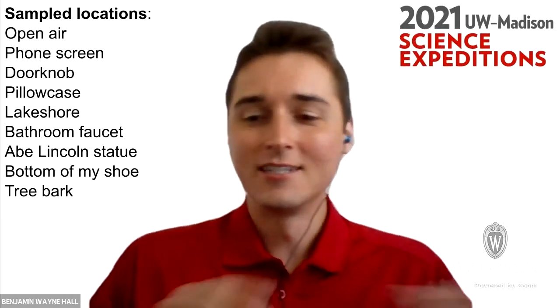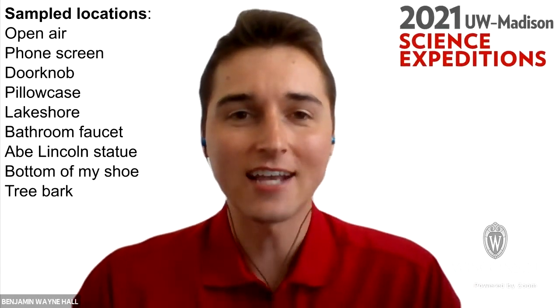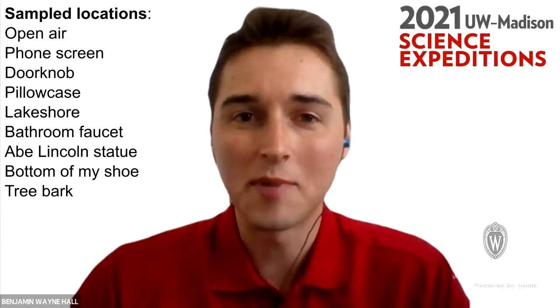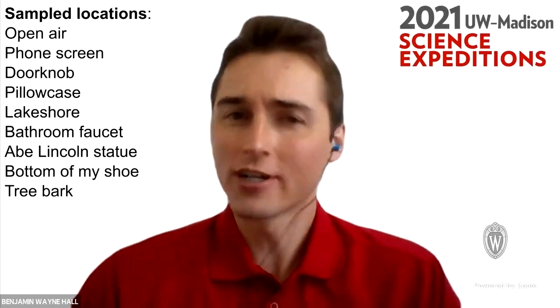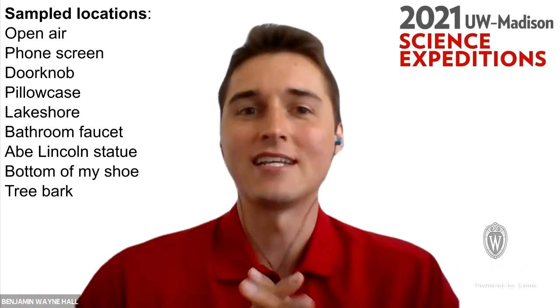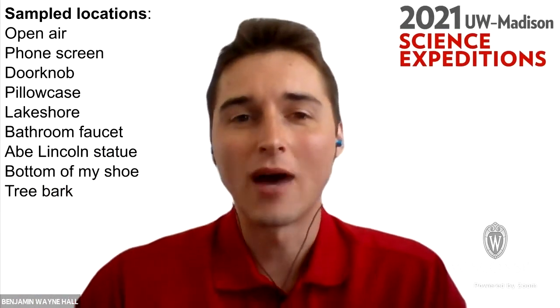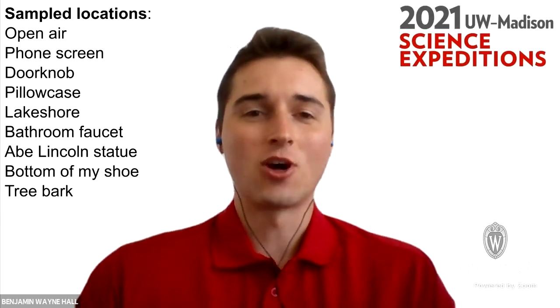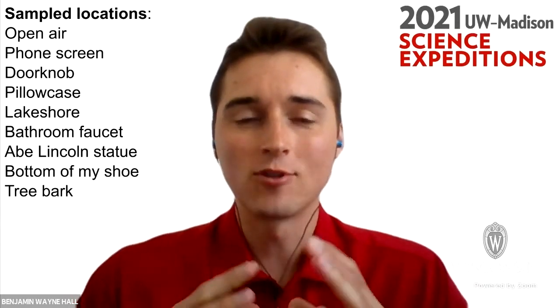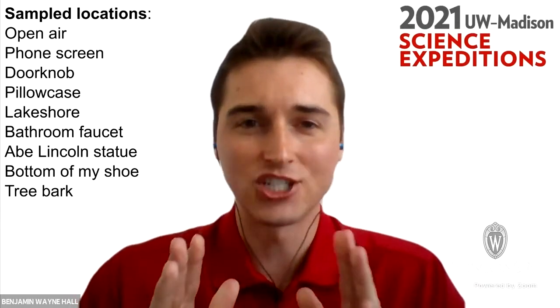What we're going to do today is take a look at the different plates that you all recommended I sample, and try to make some comparisons about what we see on the different plates and why we think there might be those differences. The first thing I want to do is ask those of you watching to make predictions.